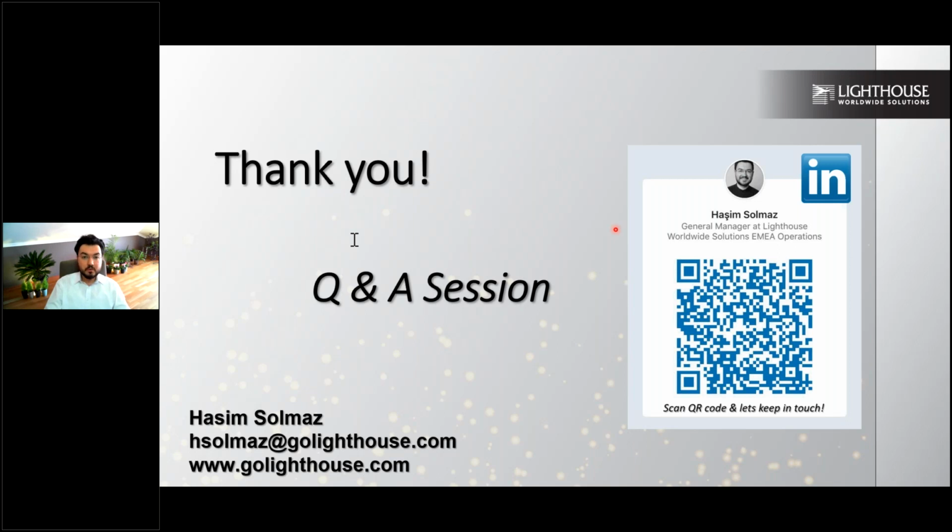So make sure you are following the same path and have the printout from your photometer or particle counter testing system set up, and have these printouts recorded along with your report. Raw data, your final report, and raw data printouts from field are essential in order to prove what you did, because what you are proving is what you write. So in order to prove what you write, you have these printouts.